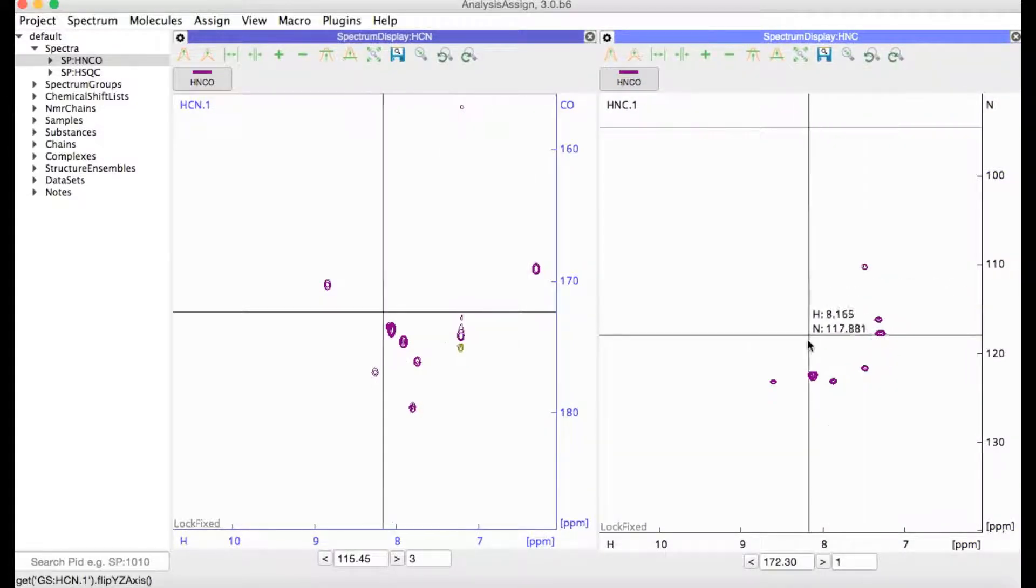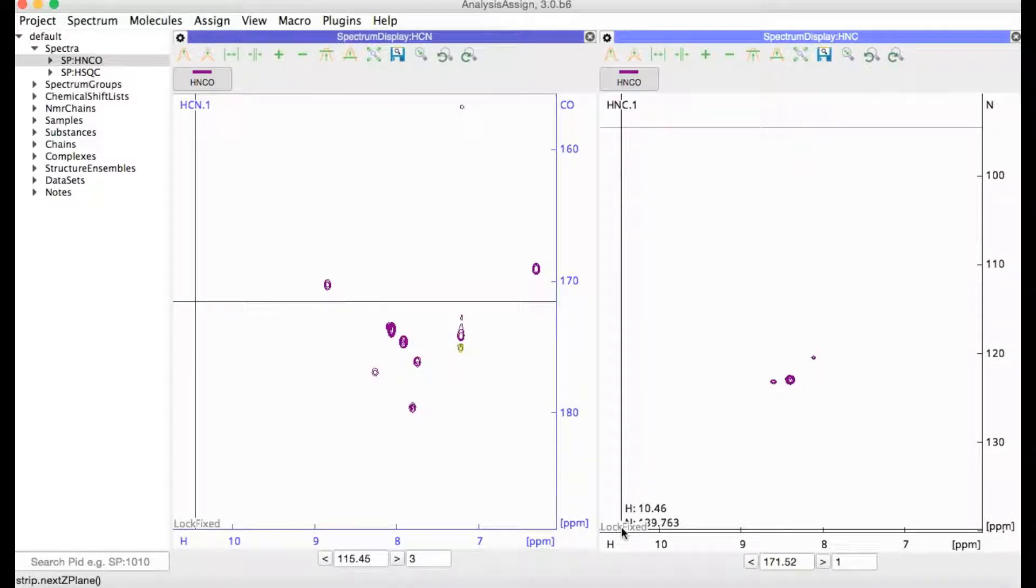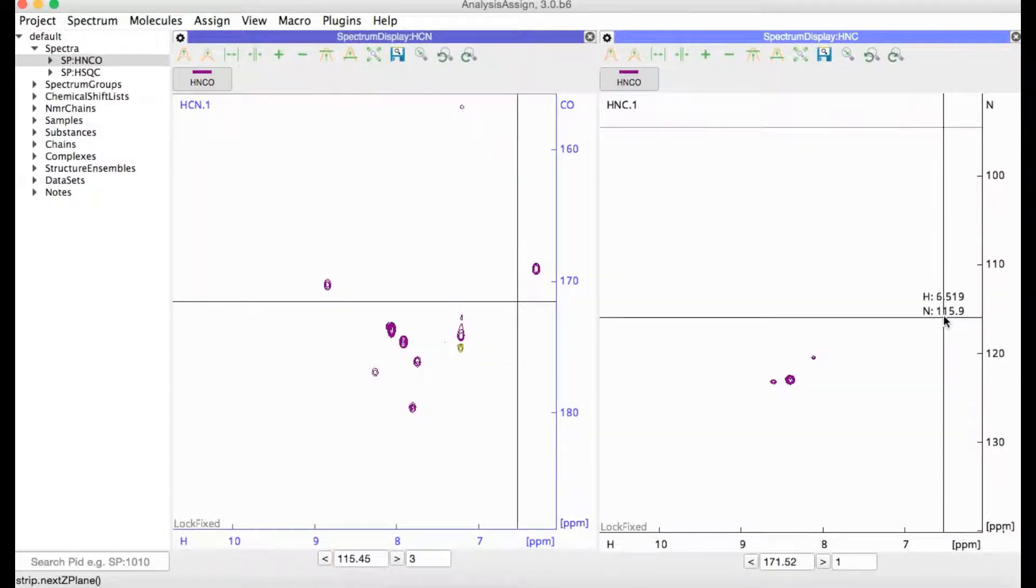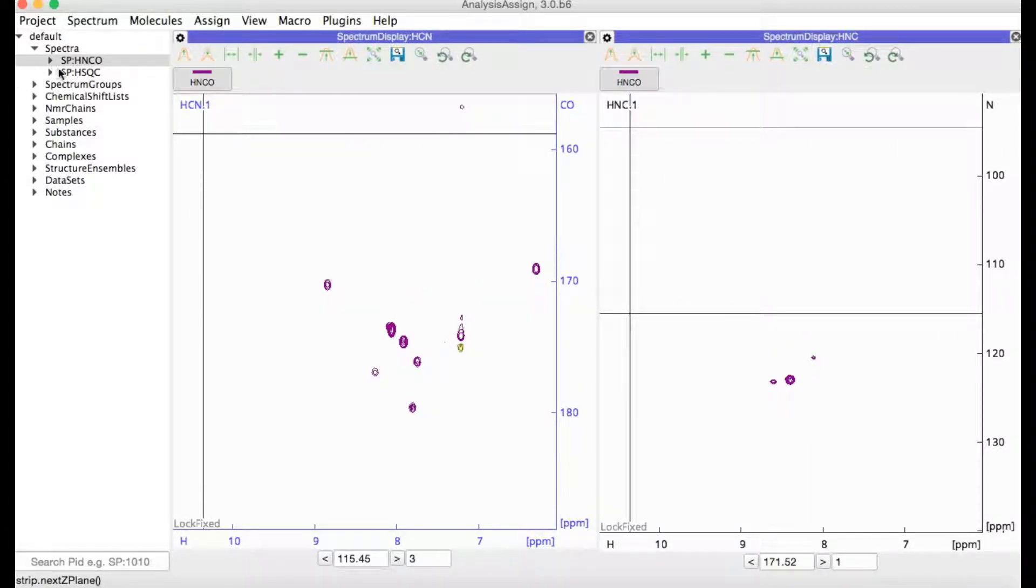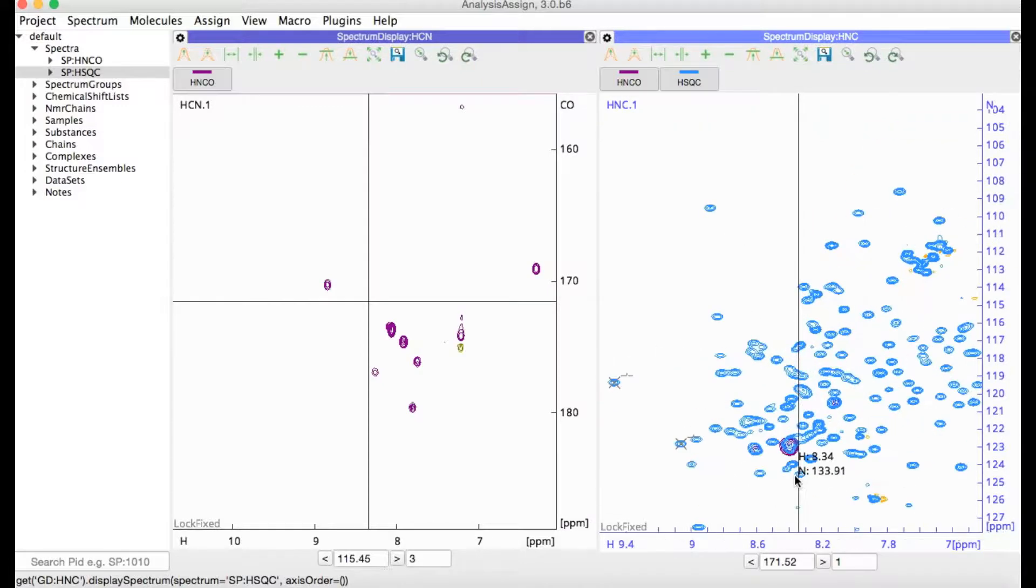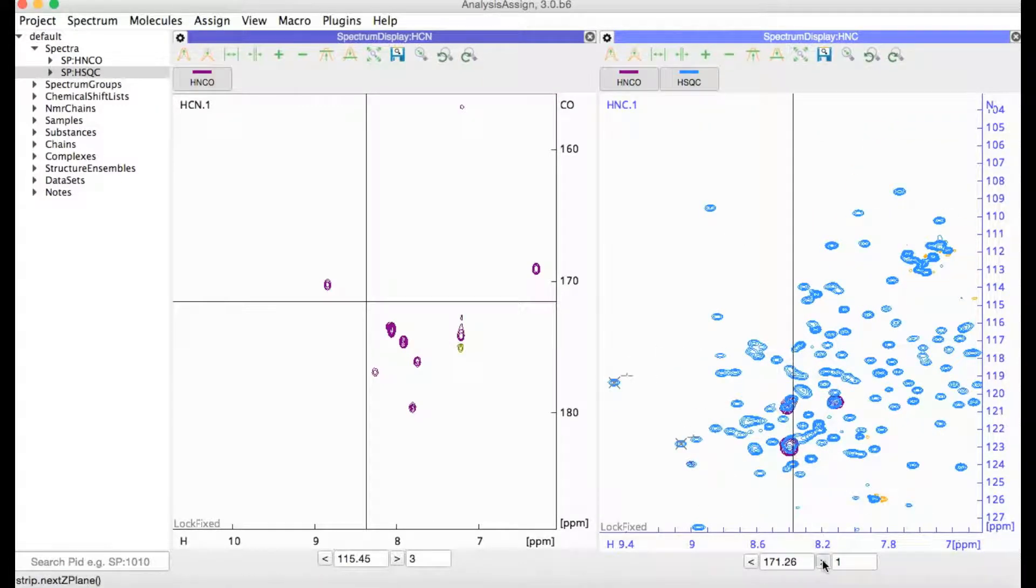In this window, I can now see the spectrum the other way around. Of course, with protons along x and nitrogen along y, I can also overlay this with my HSQC spectrum. Now I can look at both spectra together and see how well they overlay.